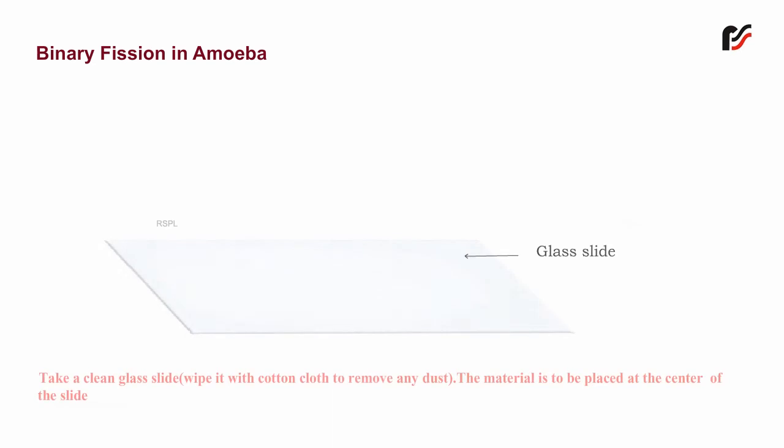Binary Fission in Amoeba. Take a clean glass slide and wipe it with cotton cloth to remove any dust. The material is to be placed at the center of the slide.